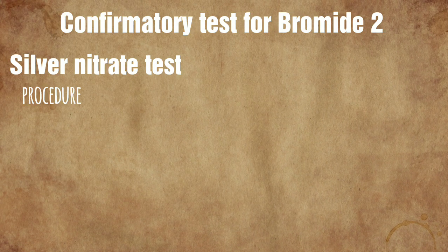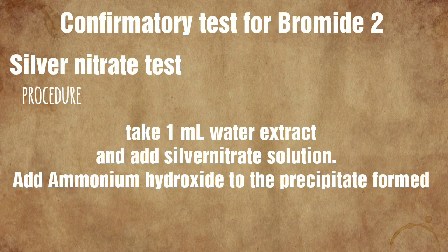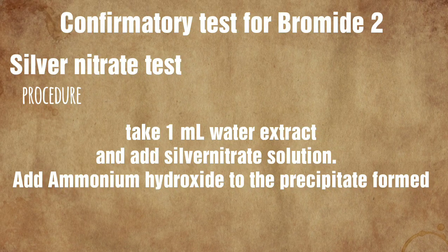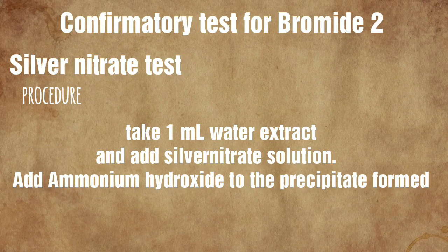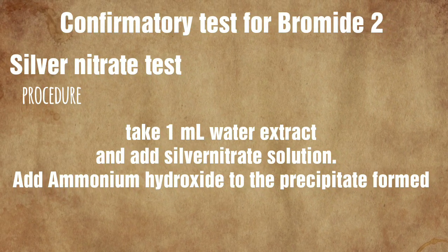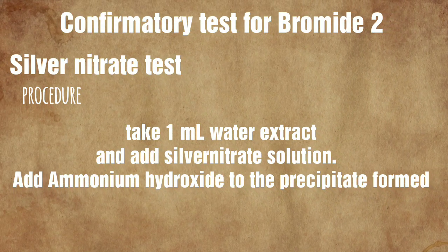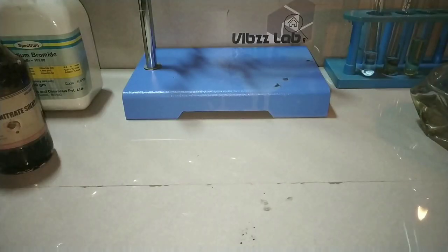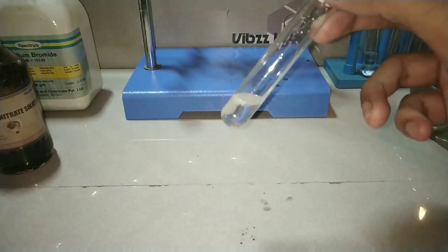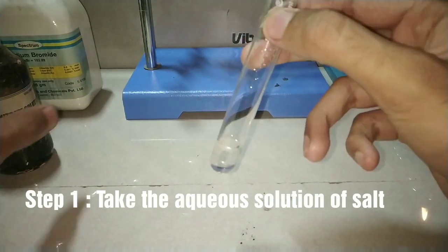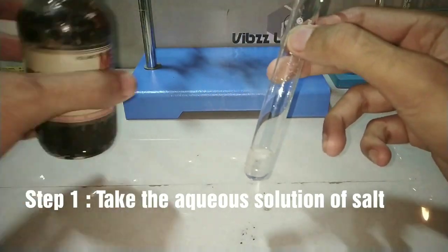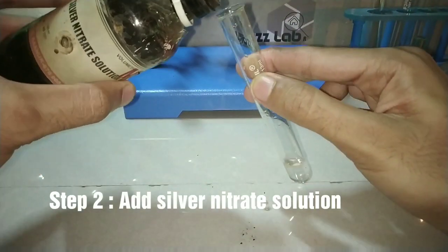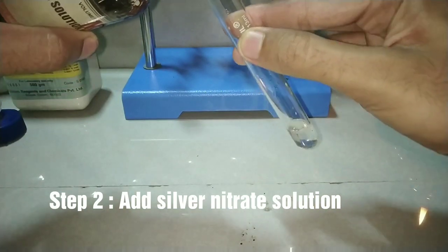The next confirmatory test is the silver nitrate test. Here we take the aqueous solution of the salt, add silver nitrate solution, and then add ammonium hydroxide. I have taken the aqueous solution of the salt, and now we will be adding the silver nitrate solution to observe the reaction.